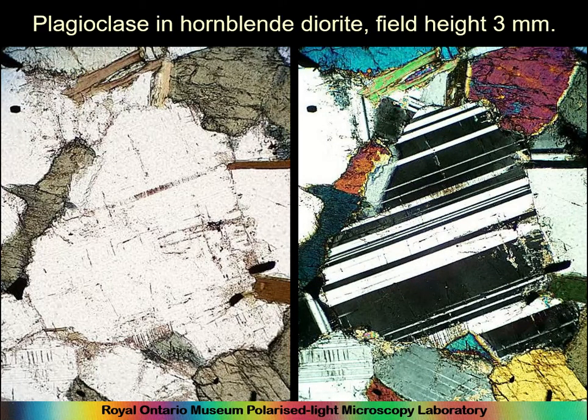And here we have plagioclase with its lamellar twinning. Straight, long blades, lamellae blades of twinning. It looks like a zebra. And the first time you look down a microscope and see it, you will say, I found plagioclase, and you will feel very happy, because it's all stripy, and it's the only thing that looks like that. So that's awesome, isn't it?